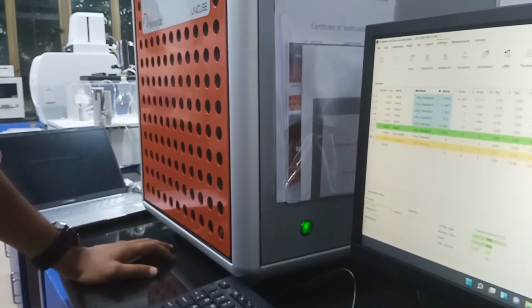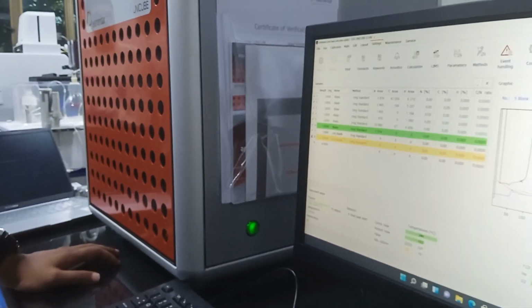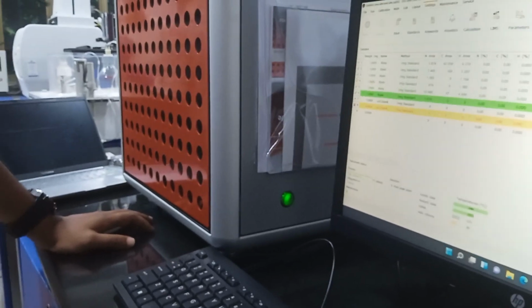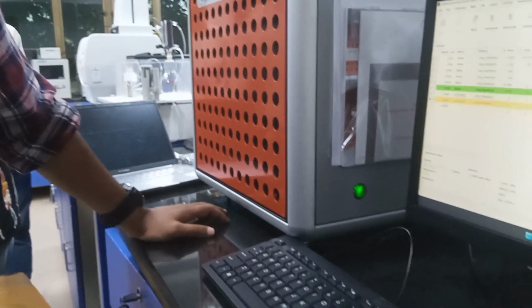Okay, how much it is spread across these gases: from this point to this point, how much it is there. From this X point to this cross mark. This is the starting point and this is the ending point, and these are the percentages of those.